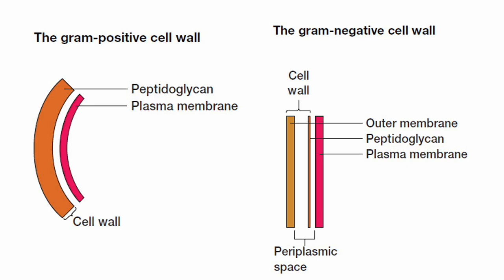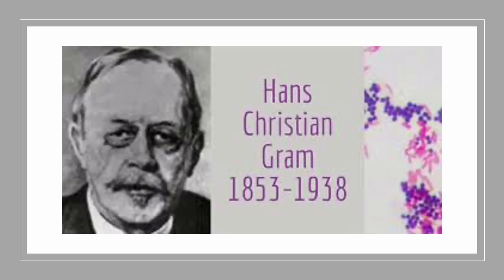Why do we need this gram staining technique? Gram staining was devised by Christian Gram. He was working with lung bacilli, and when he was working with them, he wanted to differentiate them into two types. One is the gram-negative bacteria and the second is the gram-positive bacteria.